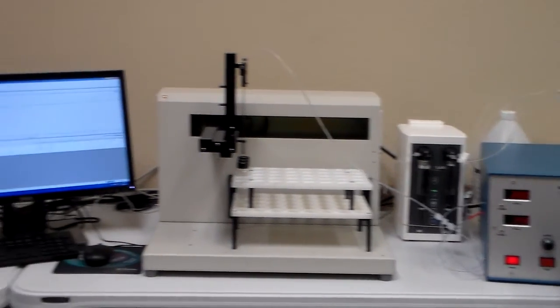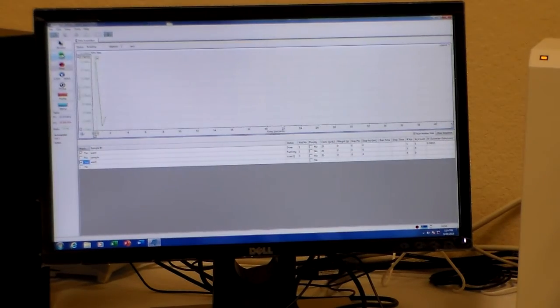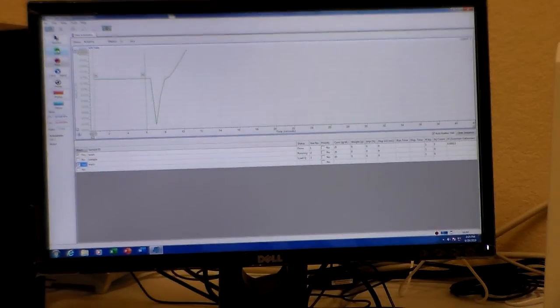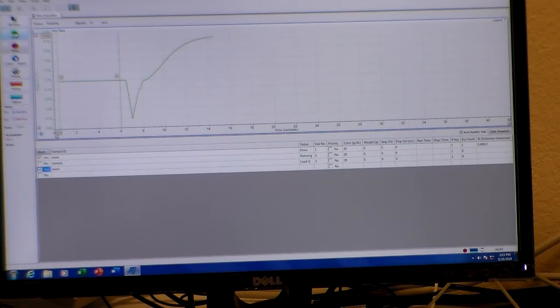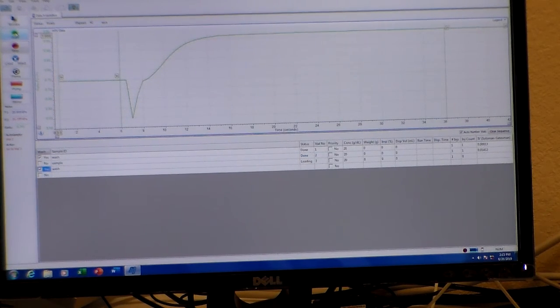And let's pan back over to the computer screen, as the data system will start recording data shortly. And the system has started recording data. And the Y501 has just injected the sample. And we see a nice smooth run up to a plateau in the viscogram. So the intrinsic viscosity for vial 2 was calculated to be 0.014, which is what we expect.